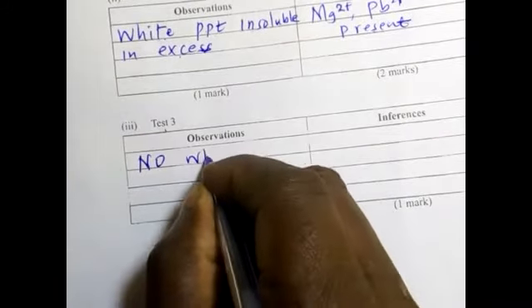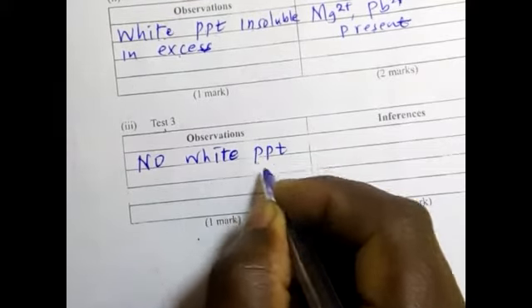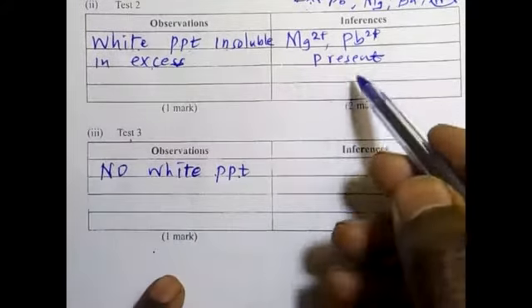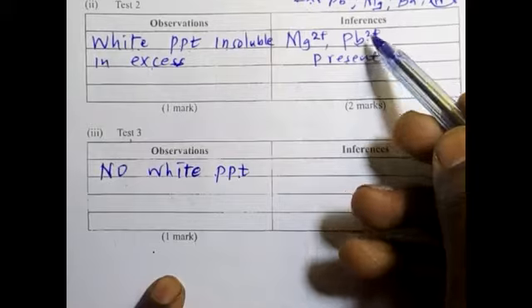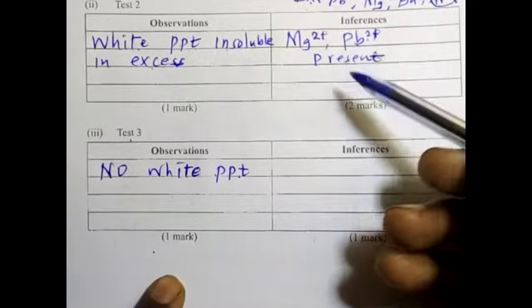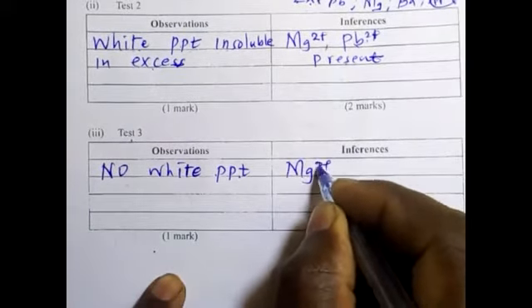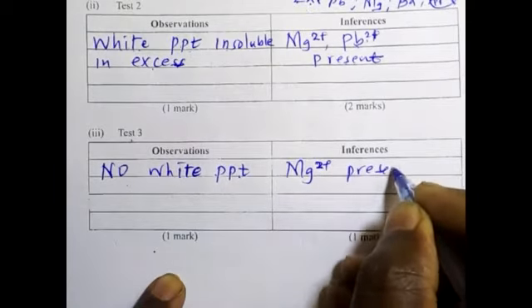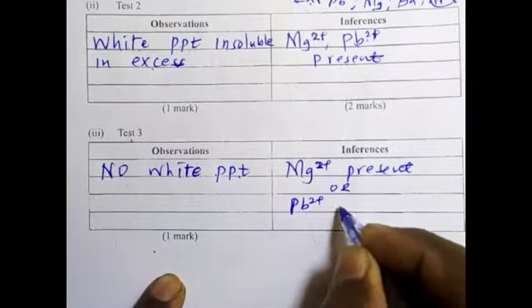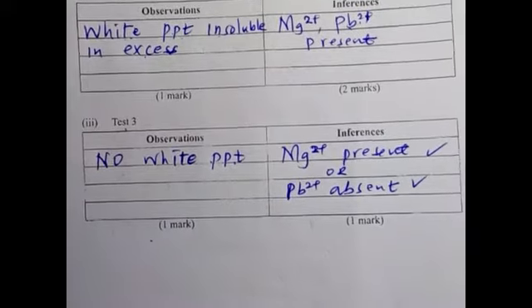No white PPT was formed. On doing the experiment, there was no white PPT. So if there was no white PPT, then it means lead ions were not there, because if the lead ions were there, they would form a white precipitate. So here we say magnesium 2 positive was present. Or you can say lead 2 positive was absent. It is acceptable.